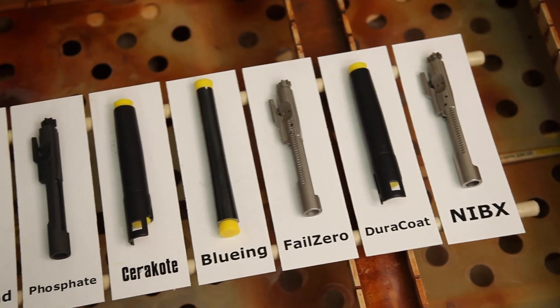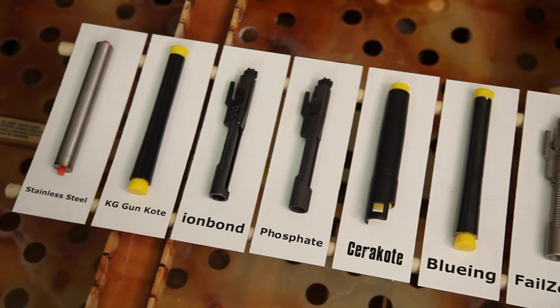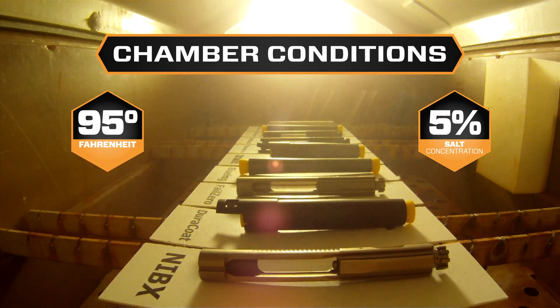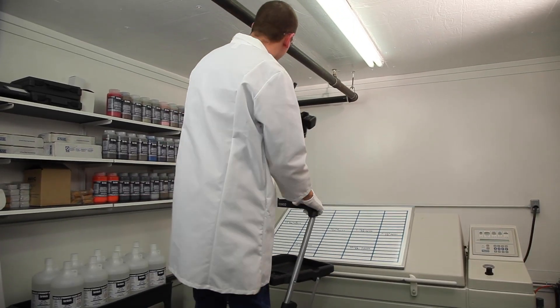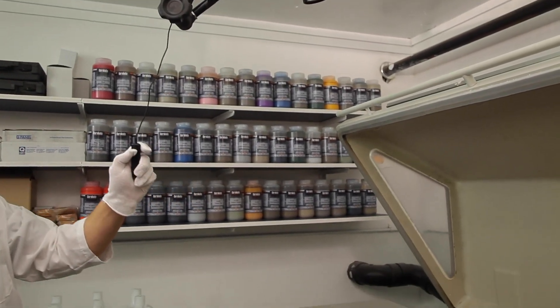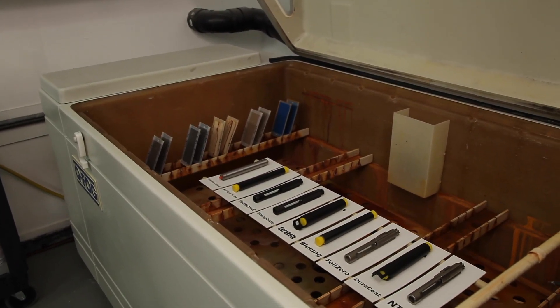In order to give you an idea of how harsh this environment is, a high-grade 416 stainless steel barrel is placed inside with the other firearm components as a baseline. The environment inside this salt chamber is so harsh that it makes it impossible to capture clear photography. We've mounted a camera to the ceiling above the chamber, and our lab tech will open the chamber door to take pictures. This salt chamber will run as long as it takes for every protective finish to show signs of corrosion.